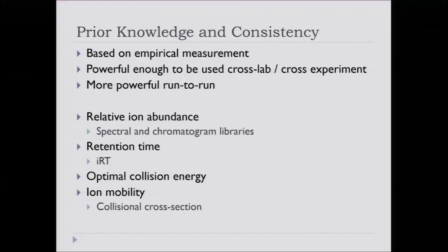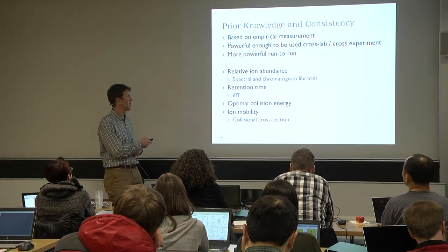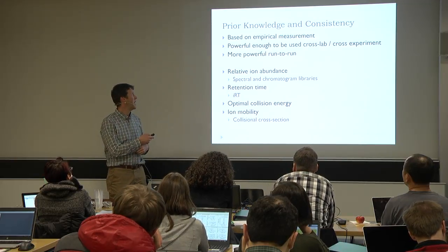So, and then we're going to take some quick looks at the data just in slides, and then we're going to get into it live. But I want to get across this. I was actually talking to somebody else about this a little bit, one of the people in this group with the other data.